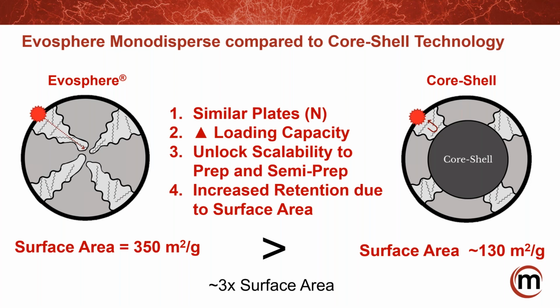And so you might say, boy, that improvement that I'm getting at the same pressure, higher efficiency, sounds like an innovation from 2005 called core shell. Well, what they don't tell you about core shell, or what wasn't really marketed when they came to market, was that the core shell material is actually monodisperse. The difference is the pore volume around the core shell material. Because of the way they make it, they have this sintered core and they grow the layers. And as the analytes get bigger, maybe that impact to the C term becomes more impactful for your resolution.